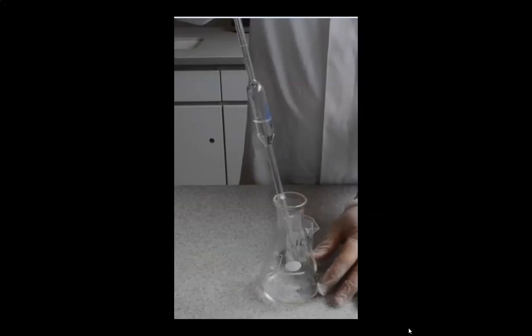Remember that after the first titration, the liquid in the flask, now neutralized, must be discarded, then rinsed out, and another 25 milliliters of acid must be pipetted into it for the next titration. This is done for however many titrations you do.